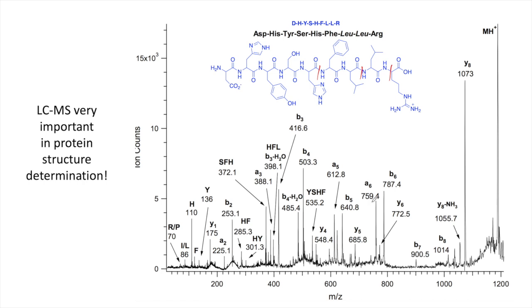The A and the B are the language that mass spectrometers use, but you can see this YSHF thing, that is tyrosine to phenylalanine, so that piece. Once we get this to smaller peptides, a computer recognizes the patterns that smaller peptides give.